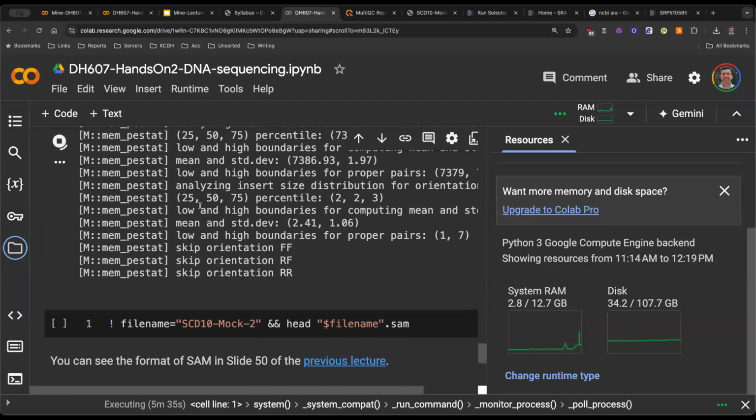So we're almost done, right? 5 more minutes and you'll see what the mutation was. You can actually skip forward. If you have gone forward, you can run the rest of the analysis and see what you get in the end.